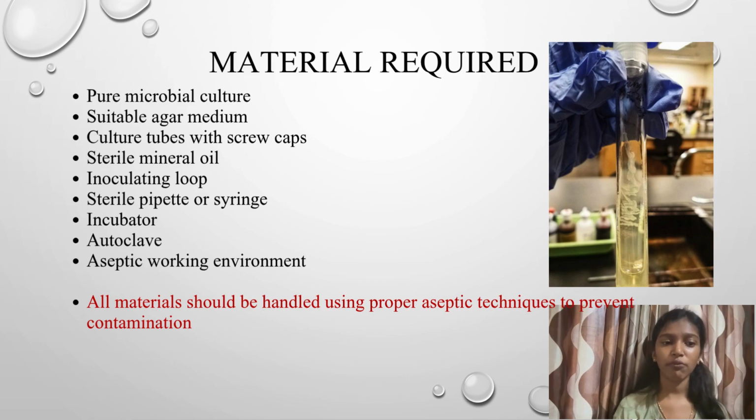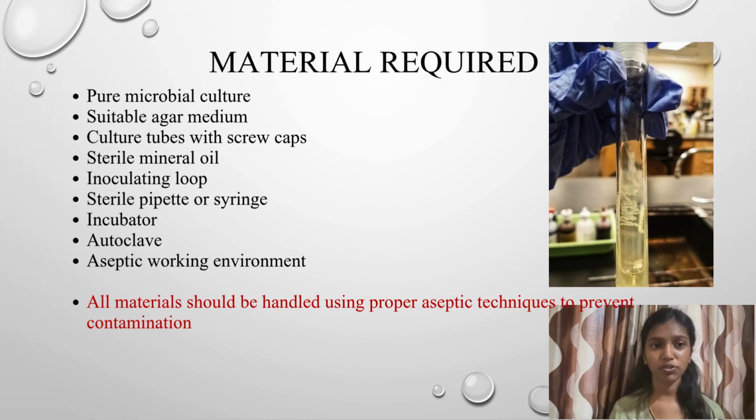The main materials required for this method include a pure microbial culture, suitable agar medium, culture tubes, sterile mineral oil, an inoculating loop, sterile pipette or syringe, incubator and autoclave. It is also important to maintain an aseptic environment throughout the process to prevent contamination.